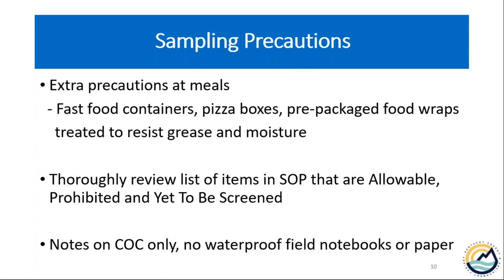Something else we don't normally have to consider, we do need to take extra precautions at meals. Fast food containers, pizza boxes, any kind of prepackaged foods, all of those will be treated to resist grease and moisture, and therefore they are known to have PFAS in them.